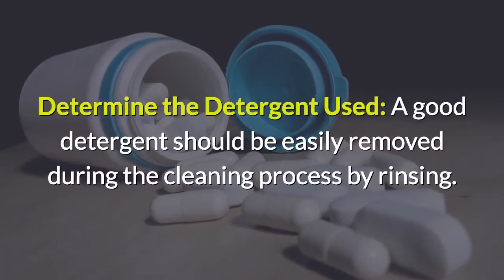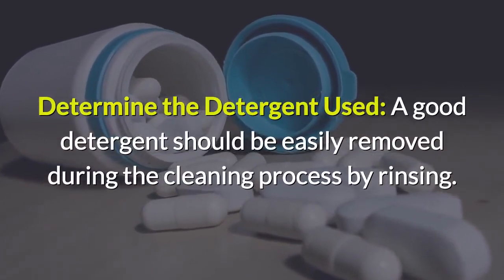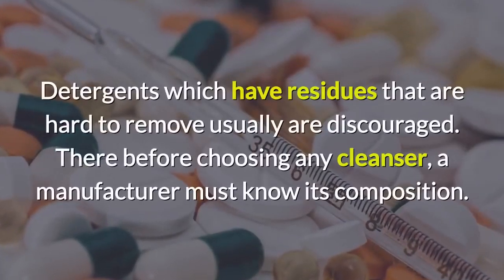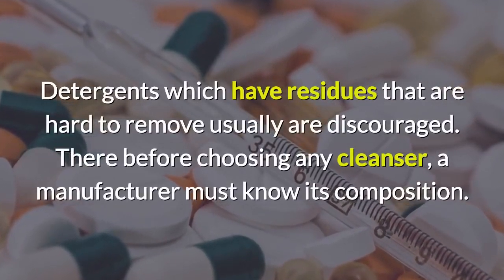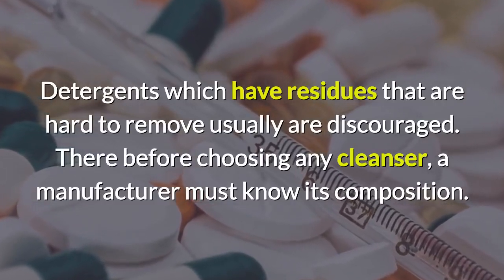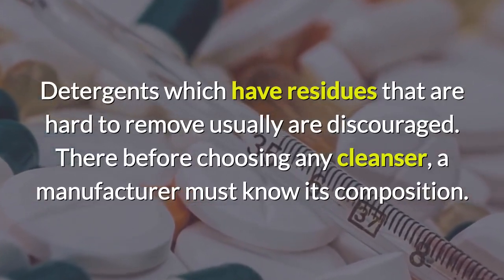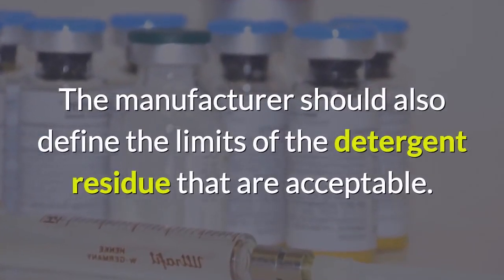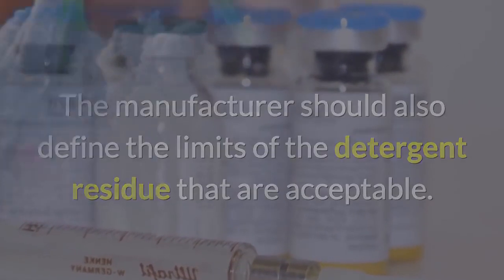Determine the detergent used. A good detergent should be easily removed during the cleaning process by rinsing. Detergents which have residues that are hard to remove usually are discouraged. Before choosing any cleanser, a manufacturer must know its composition. The manufacturer should also define the limits of the detergent residue that are acceptable.